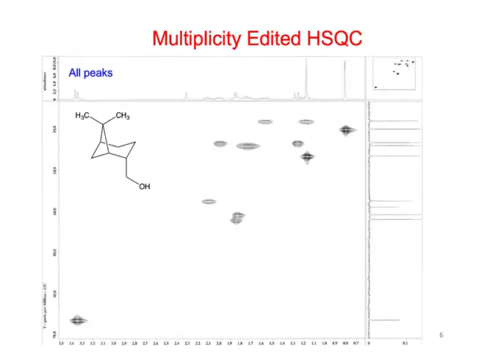Okay, so this is an HSQC experiment. So this is showing us one bond coupling. This stands for heteronuclear single quantum coherence.